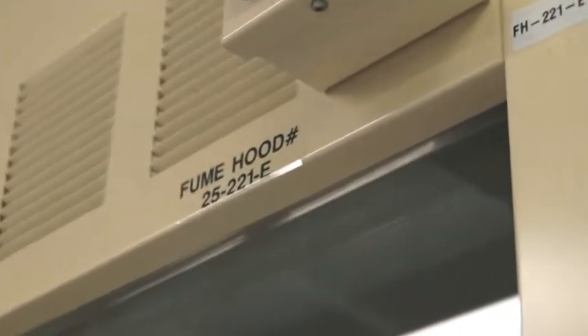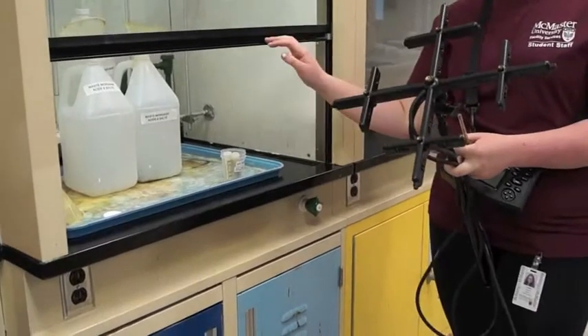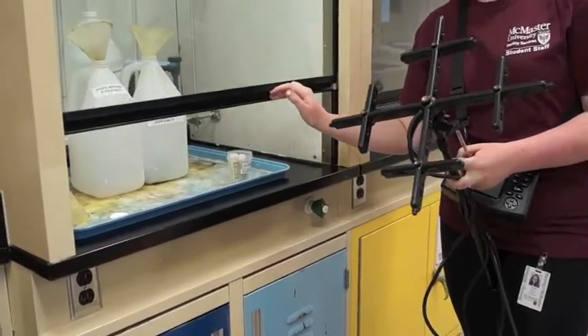A fume hood is typically a large piece of equipment enclosing five sides of a work area, the bottom of which is most commonly located at a standing working height.